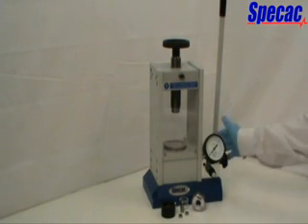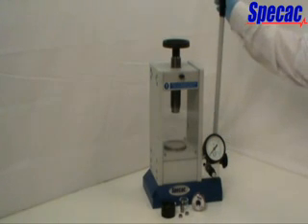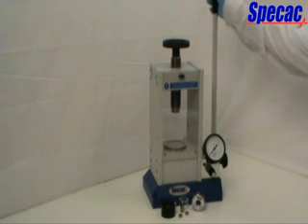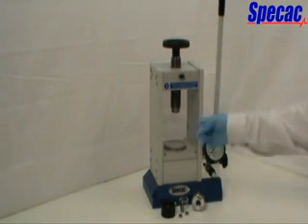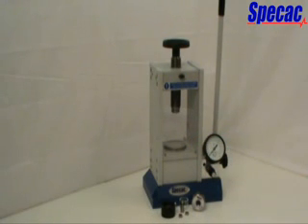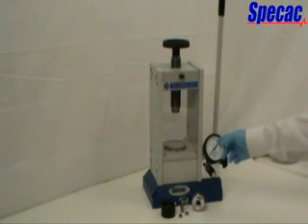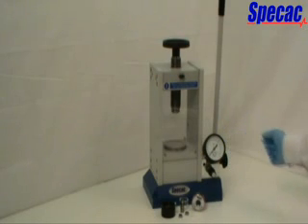The press consists of a pump block assembly where the oil is pressurised by the simple pumping action from a handle, and the sample pressing side where the pressurised oil is forced to raise the piston assembly. When resistance is offered by a sample, the pressure build-up in the system is shown on the 15-ton load gauge located on the pump block assembly.